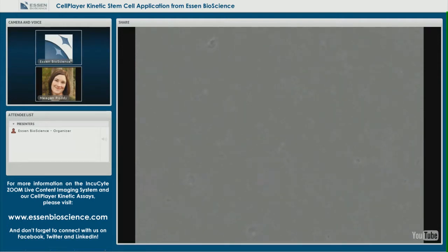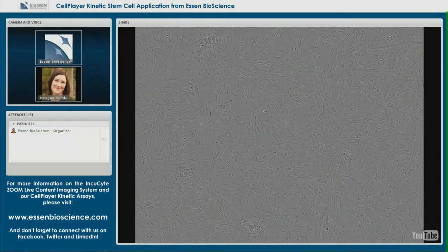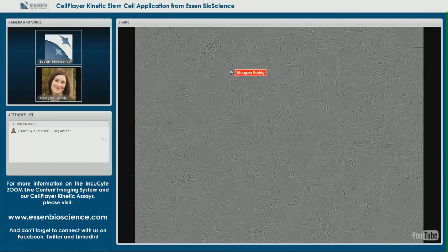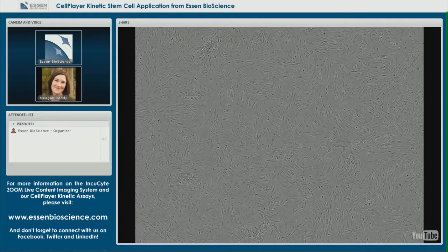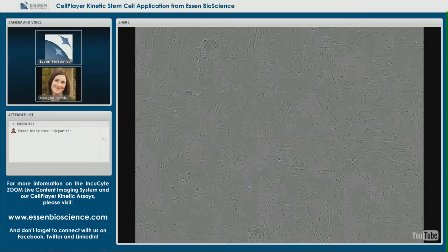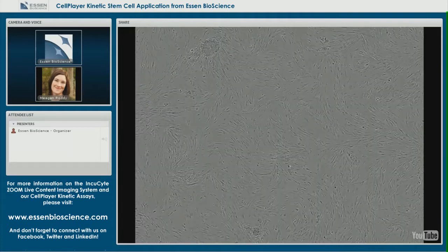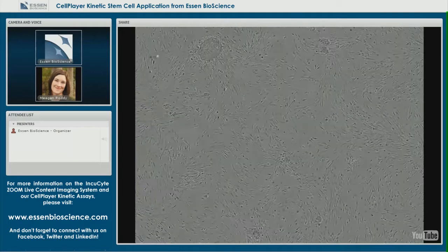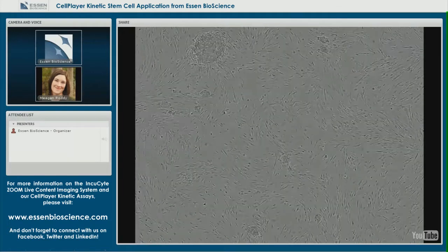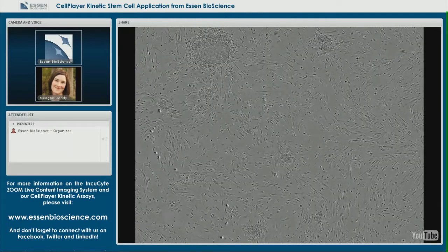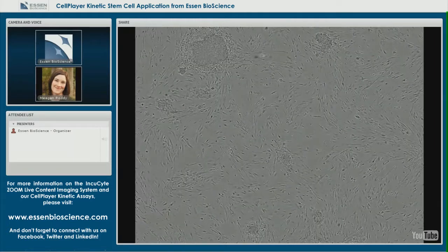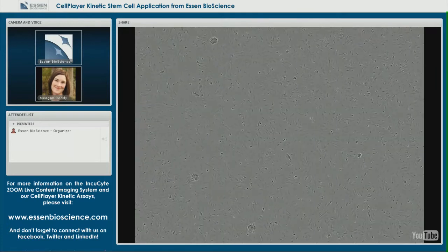These are neonatal foreskin fibroblasts reprogrammed using CytoTune. This movie takes us from day 7, just after cells are seeded onto mouse embryonic fibroblast feeder cells, all the way through to day 19, just before the colony is positively selected. The colony to watch is in the upper left corner — you'll see it grow and become more embryonic stem cell colony-like, and you'll actually see it get picked.